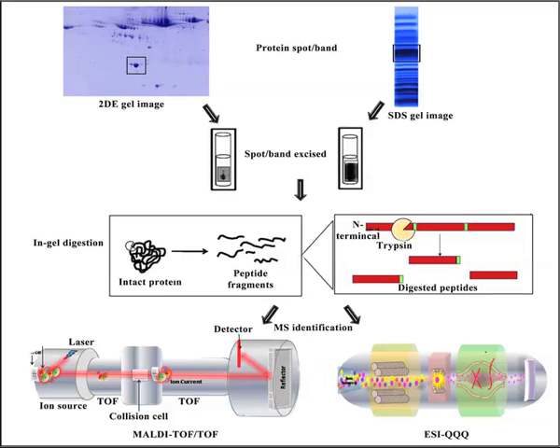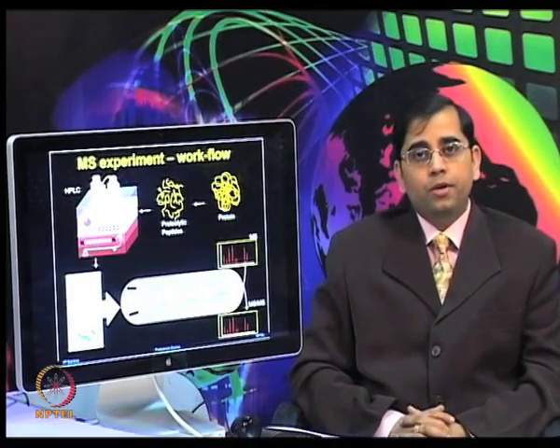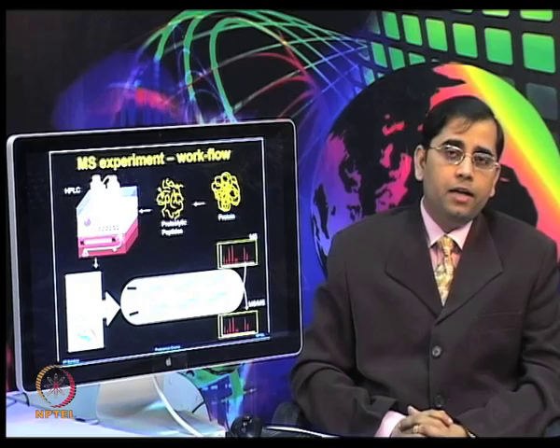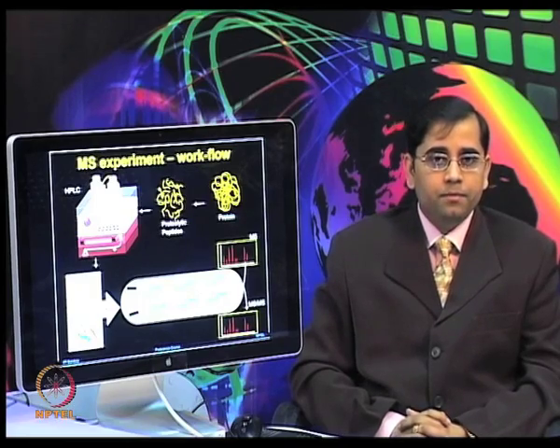These can then be further analyzed by using an ionization source and mass analyzers. The slide shows you an overview of the workflow involved in performing an MS-based experiment.